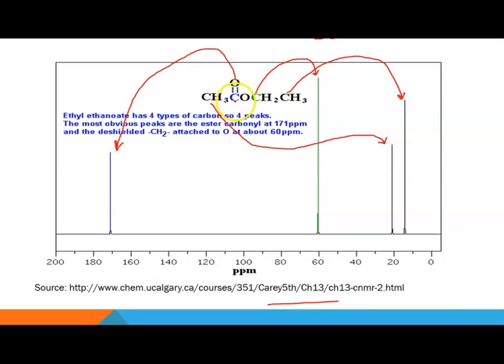And this carbon is also losing electron density to this oxygen. And because of that, this carbon is becoming slightly more positive. So this carbon on the end will start to lose a little bit of electron density. And we've said this before, if you lose your electron density, then you're going to lose your magnetic field. So that here is represented by the second peak.